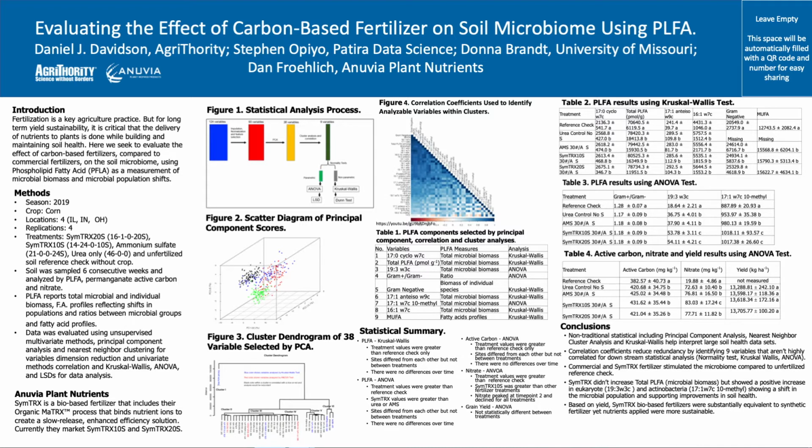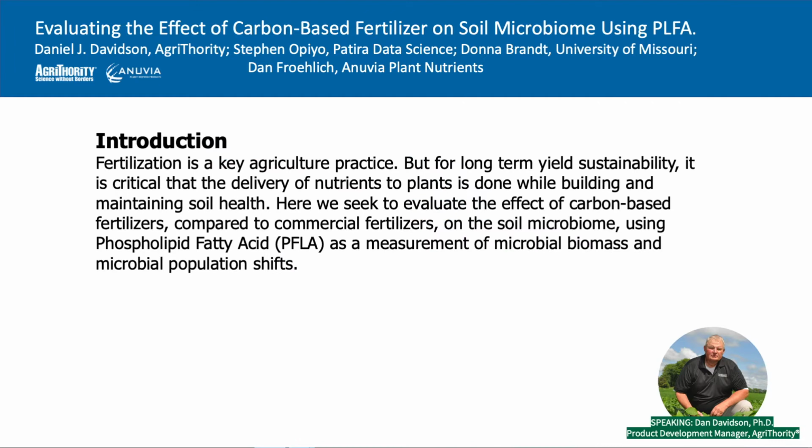It is a pleasure to be here today to briefly present the poster evaluating the effects of carbon-based fertilizer on soil microbiome using PLFA. The objective of this study was to evaluate the impact of bio-based fertilizers on the soil microbiome using the phospholipid fatty acid test. This test measures and identifies the PLFAs found in a soil sample, offering a quantitative indication of microbial activity as well as the balance of different microbial groups in the soil.